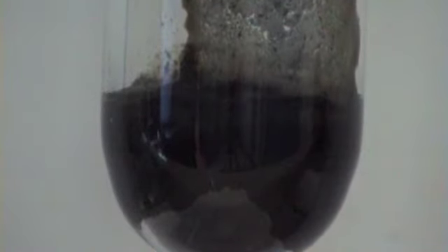Well, if it's going outside the tissue, it's going against gravity, isn't it? Surely it couldn't do that. This is called starch iodide paper. I'll explain how it works later, but it's going up the tissue, isn't it? That's fantastic. I'm trying to lower the starch iodide paper in there. It's not meant to go against gravity.